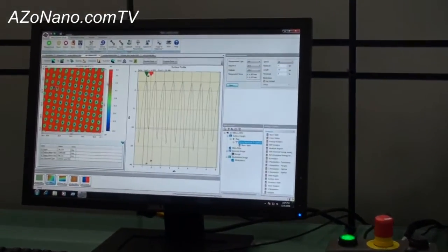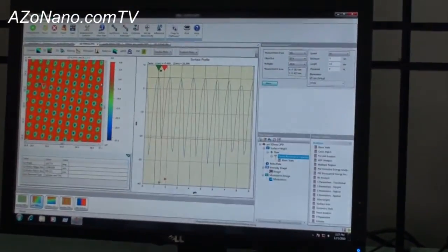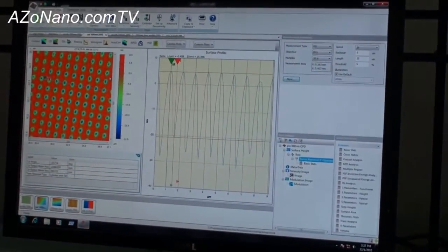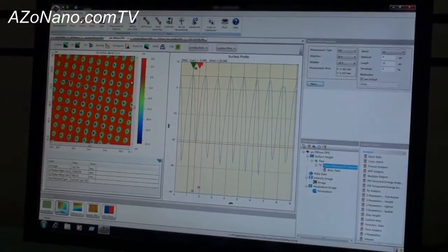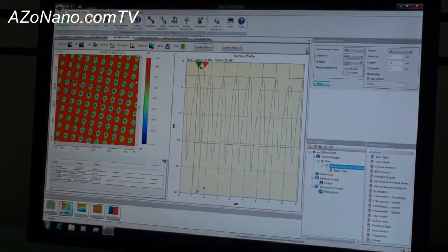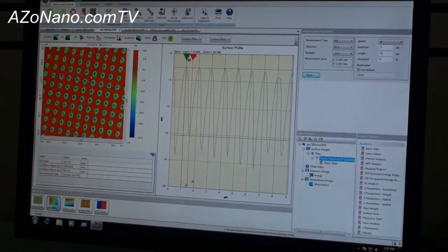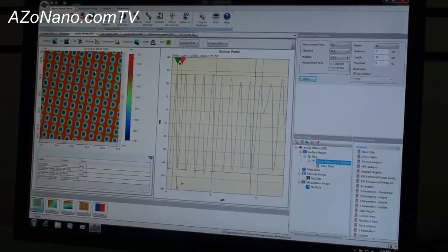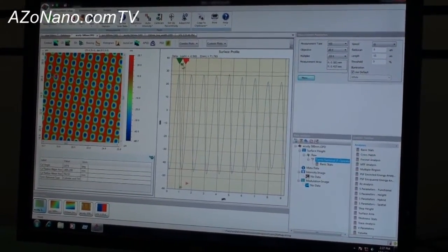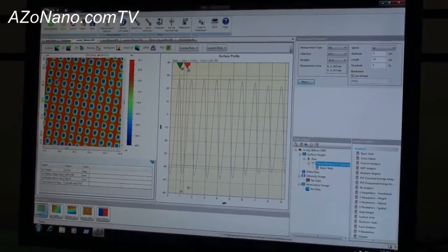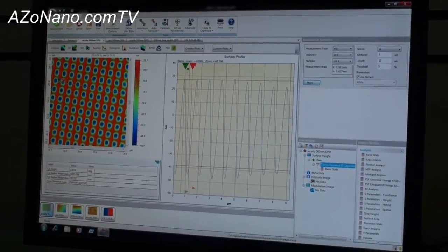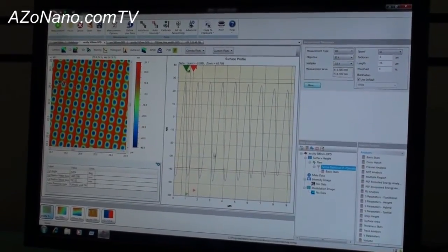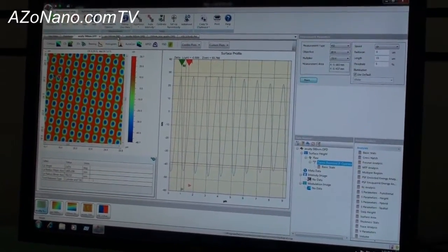Here's some round holes. These holes are 500 nanometers wide, about 120 nanometers deep. Here it is with the regular measurement and then here it is with the acuity again. You could see, look at that. We could really see the shape if you look here on the cross section profile. You could really see the shape of these.